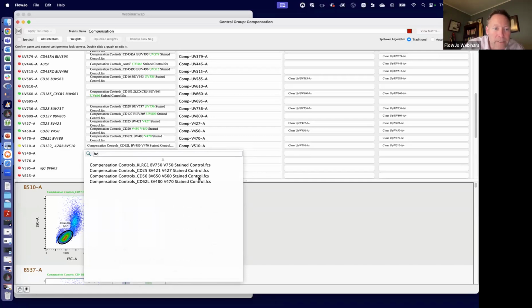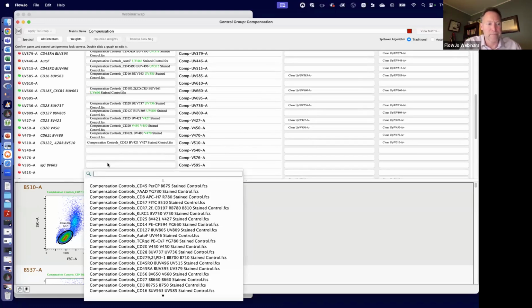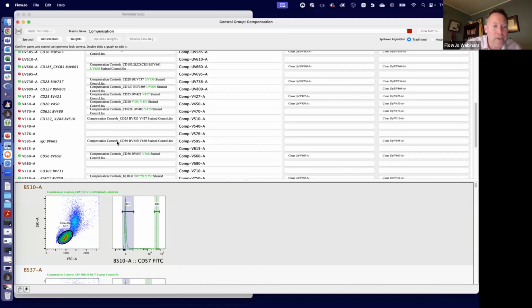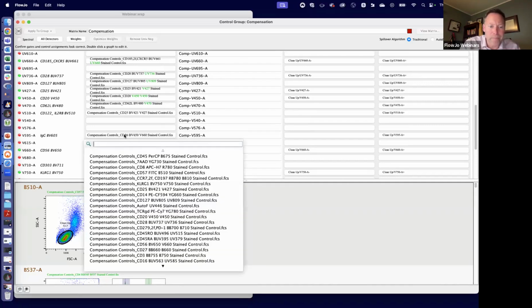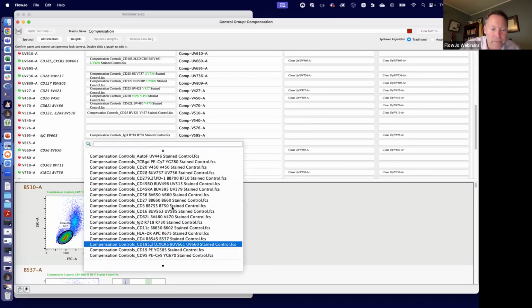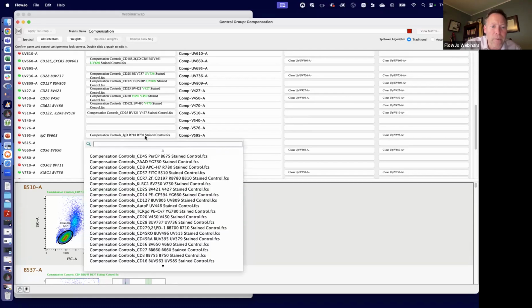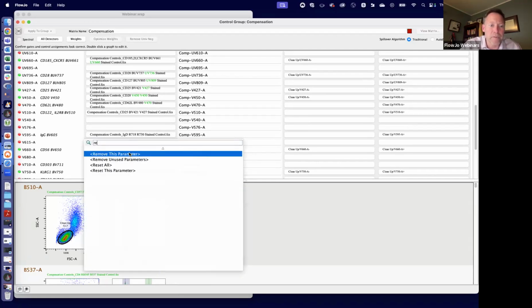Or something close to that. That was probably there. Okay. And 605, that was the one we found earlier. Copy that one. Okay, that was somewhere else. Oh, no. That is down below. It's this one here. Oh, that's IGD. Where did IGG go? And anyway, to sort, I can just do, no, I guess I do not have that one in this panel, so I will remove that one then. And I can type RE to remove a given parameter.